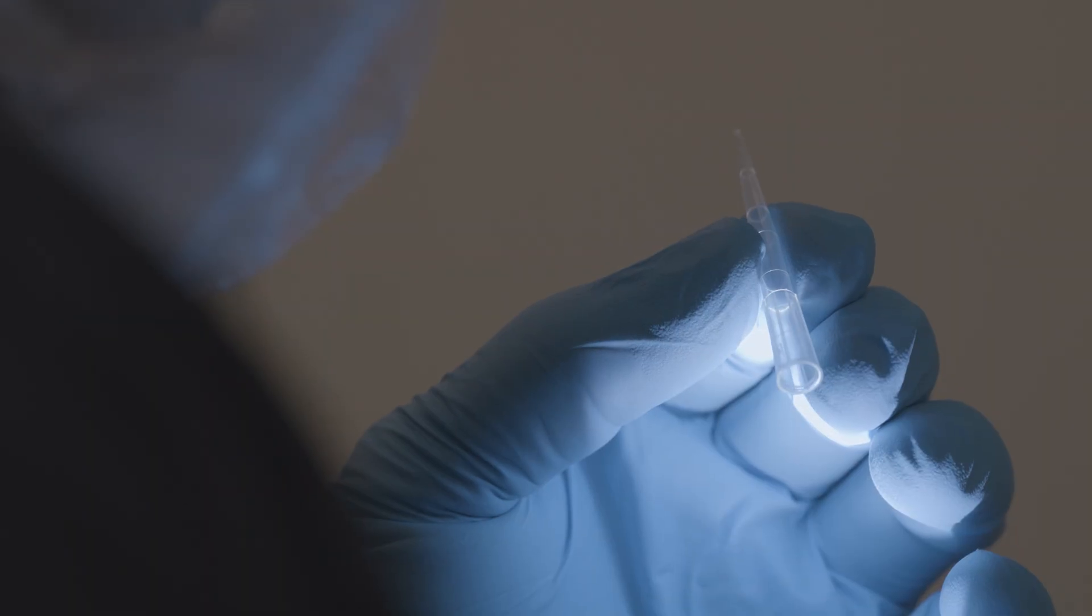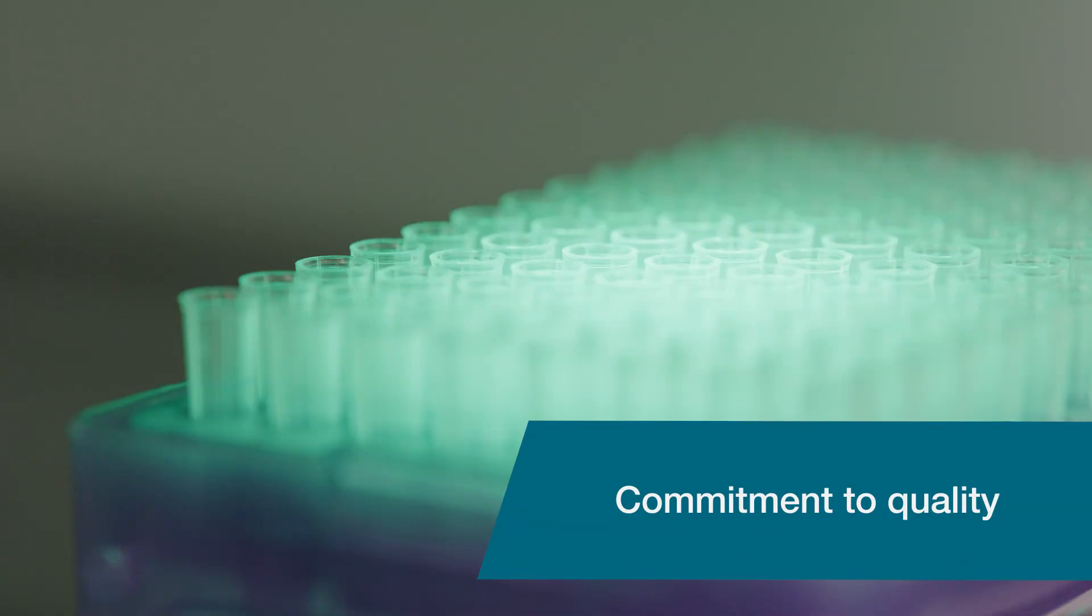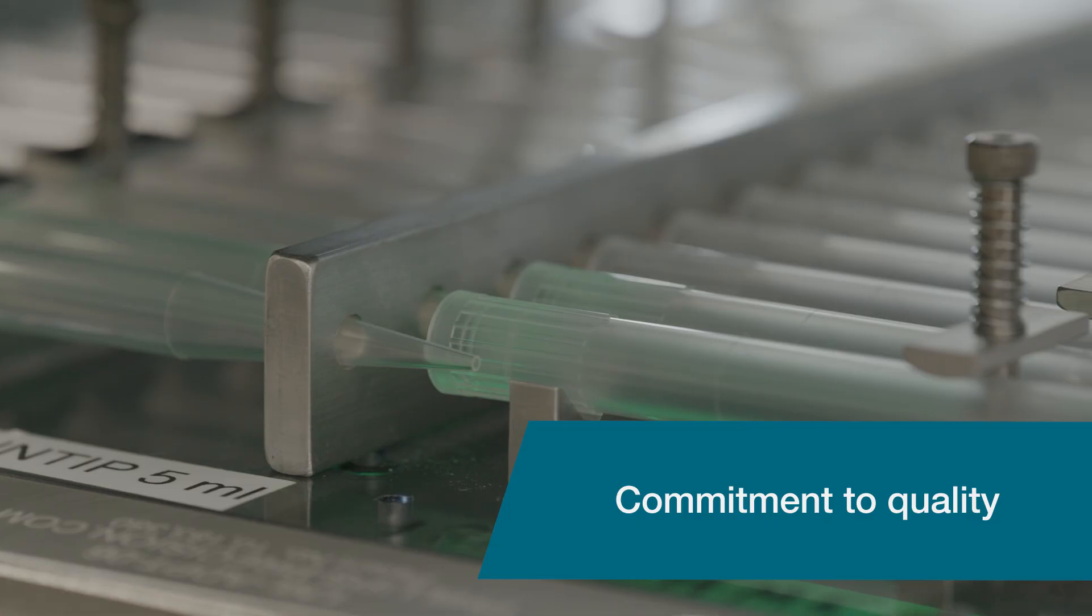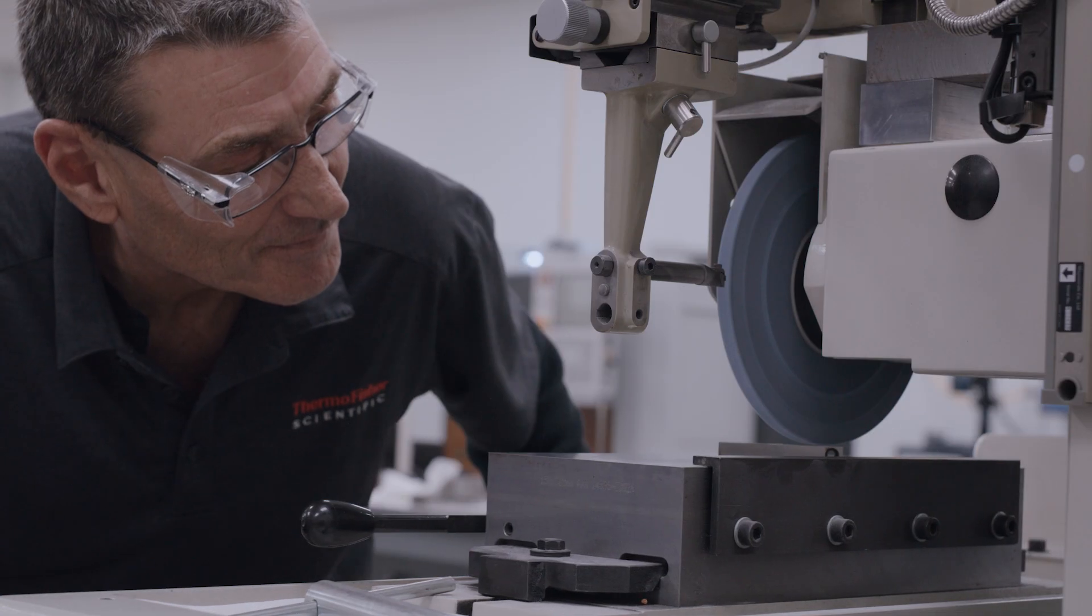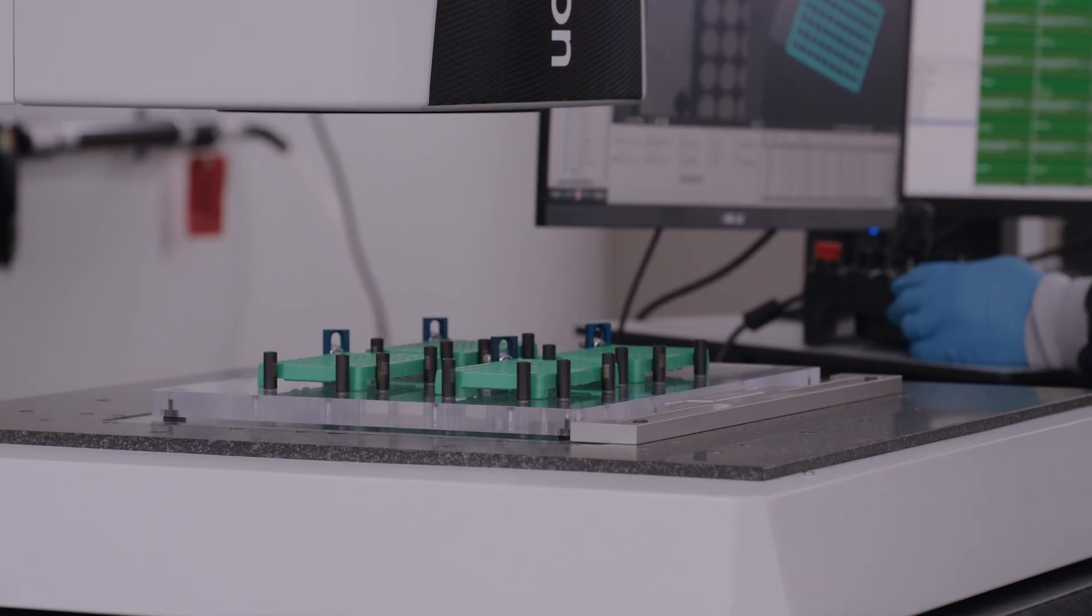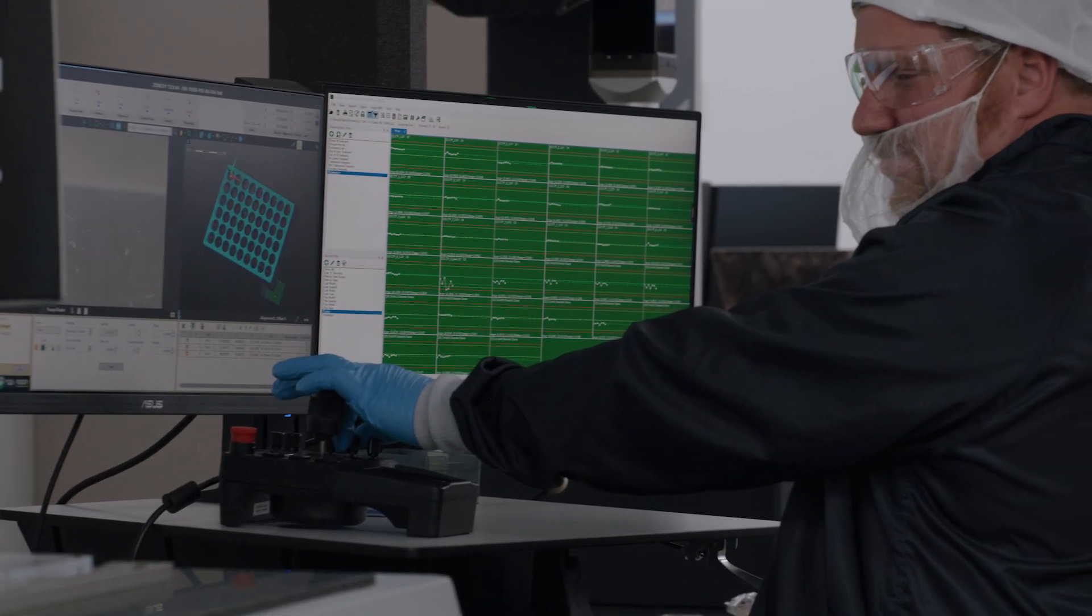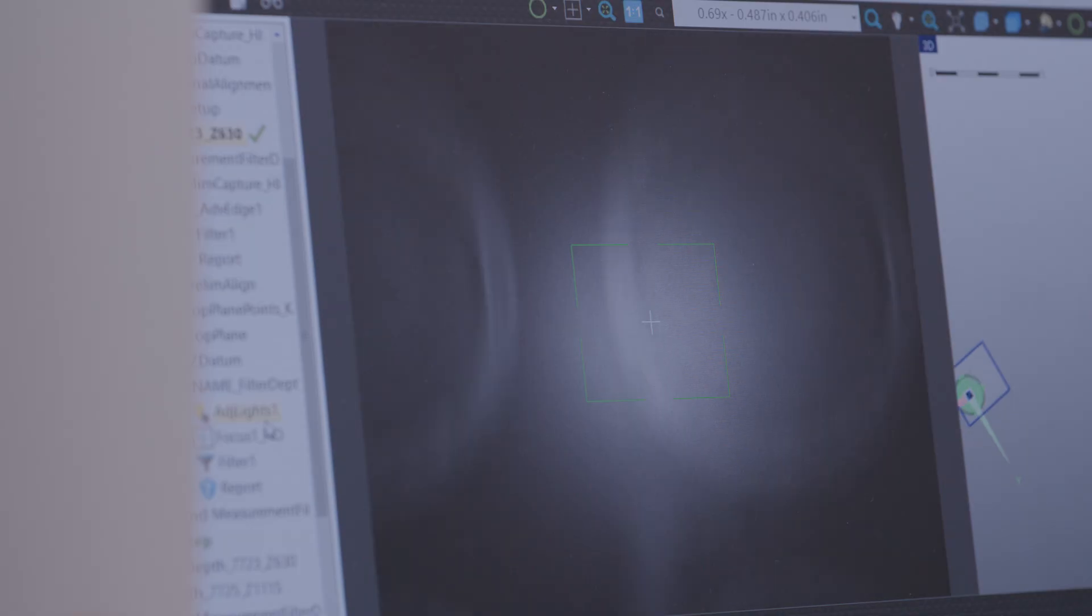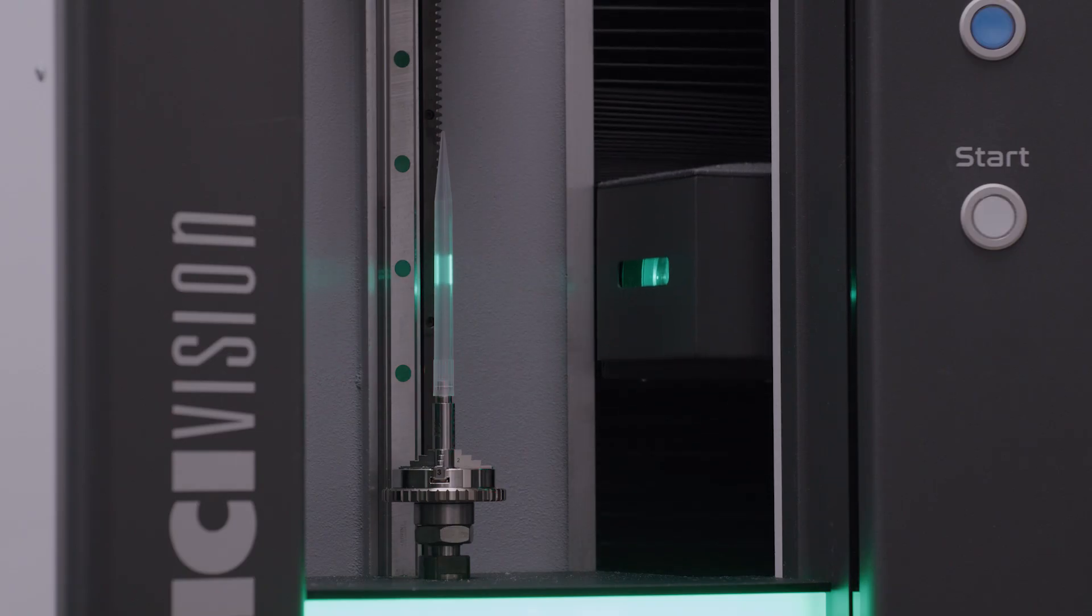At the core of the facility is a steadfast dedication to quality. Using a 10-point inspection, the Quality Assurance Lab helps ensure that every pipette tip produced meets the highest standards. The process begins with meticulous machine setup and visual inspections under microscopes. Functional and dimensional testing follows, measuring precision down to the 1 ten-thousandth millimeter.